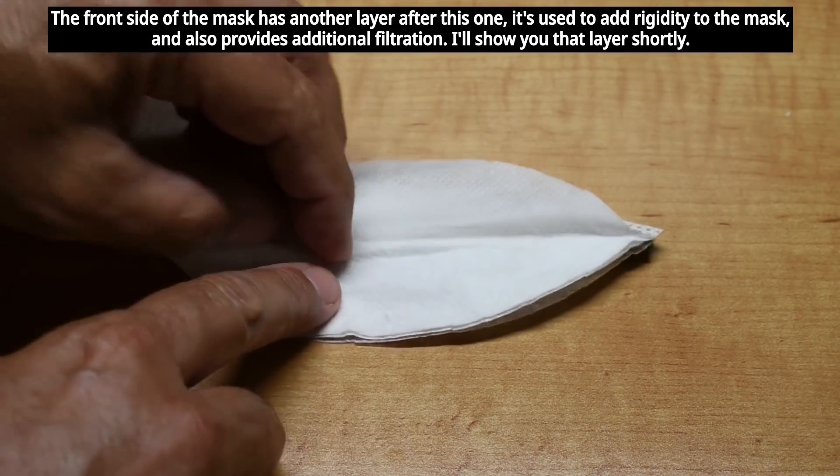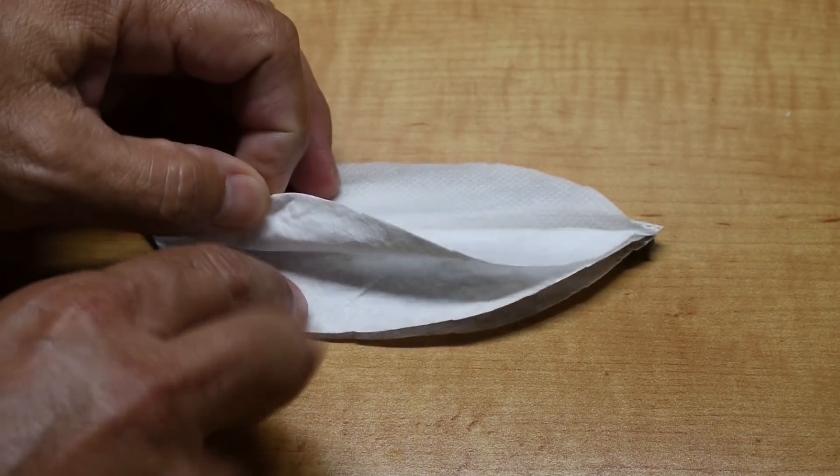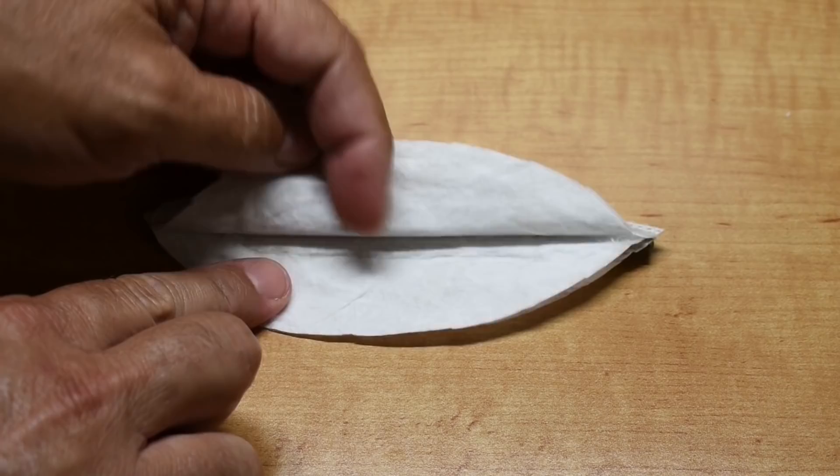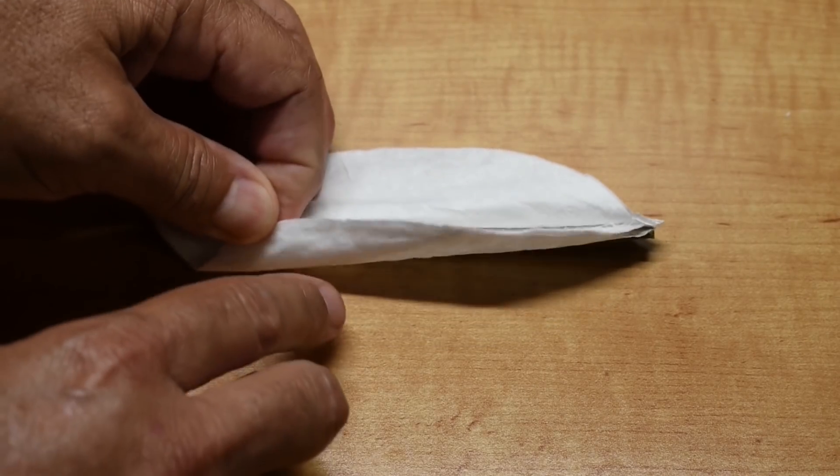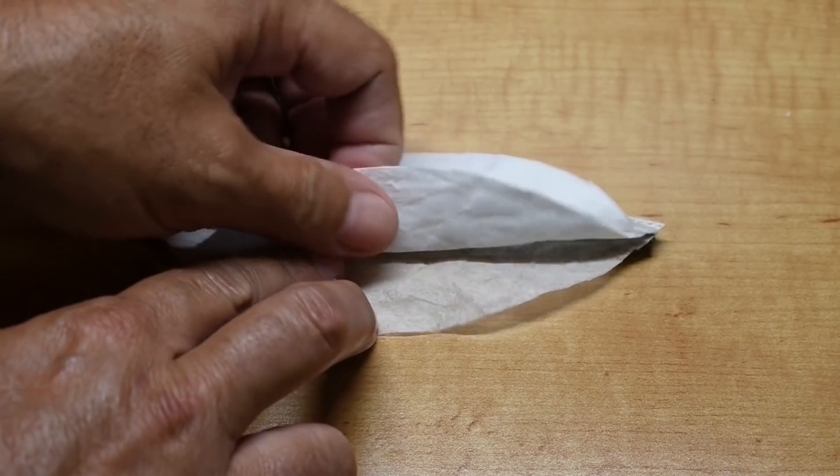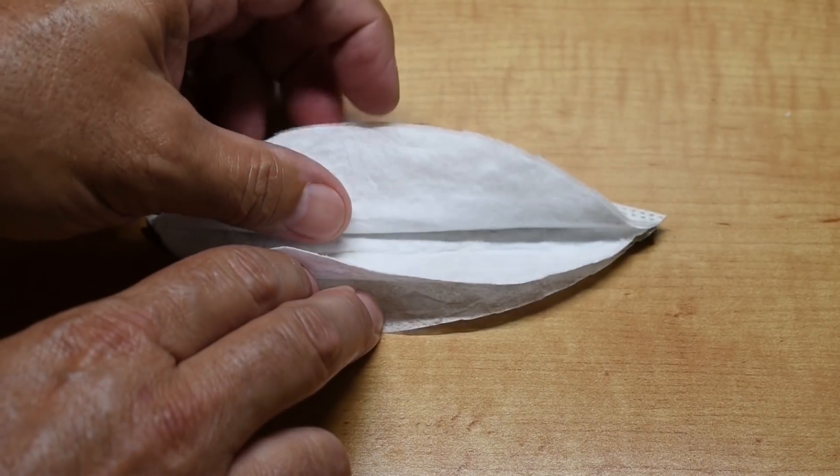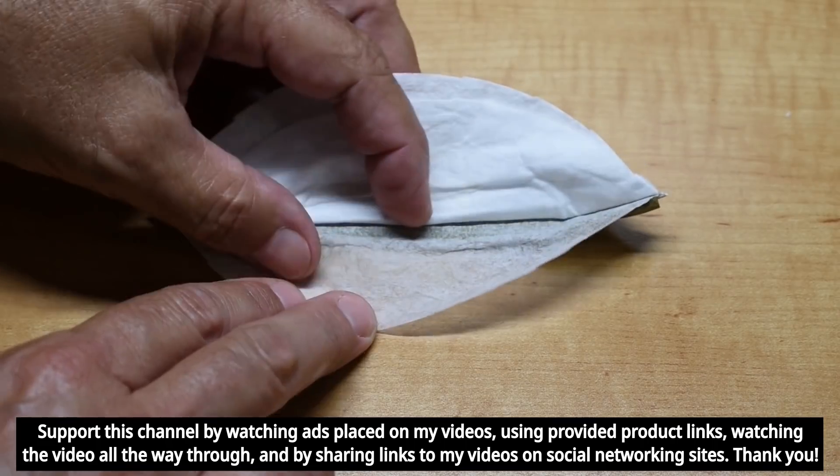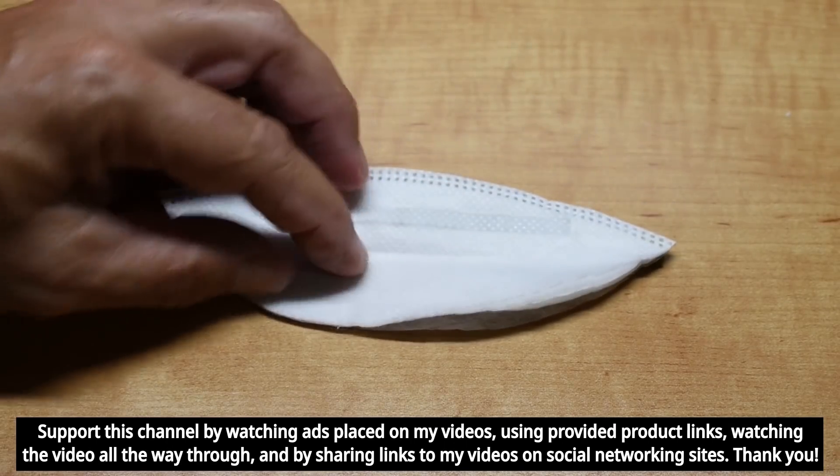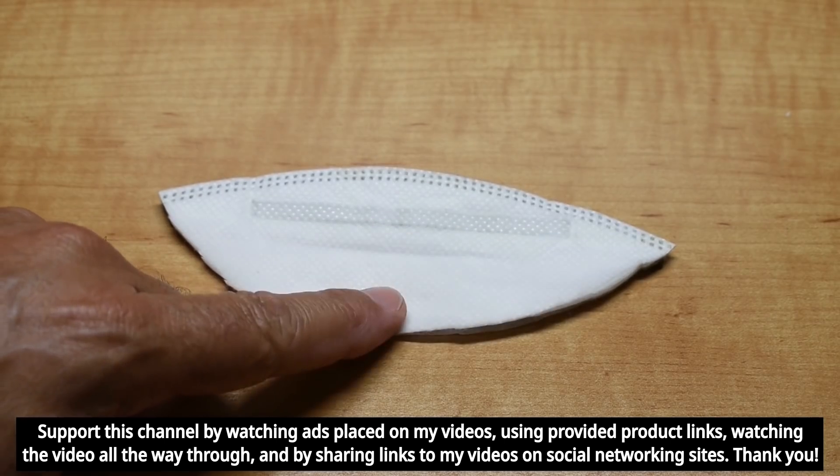Then you have this next layer right here, which is much thicker. And then under that is another layer, just like this other layer here. And then you have this bottom layer which is much thinner. So let's start by looking under the microscope at this layer right here on top.